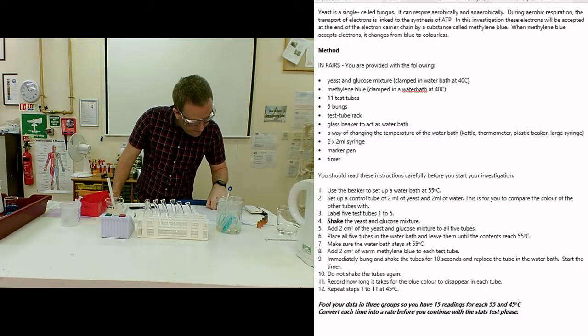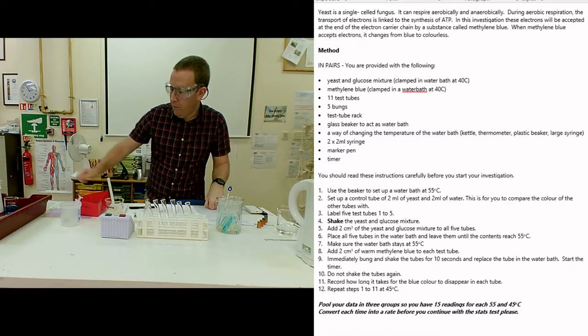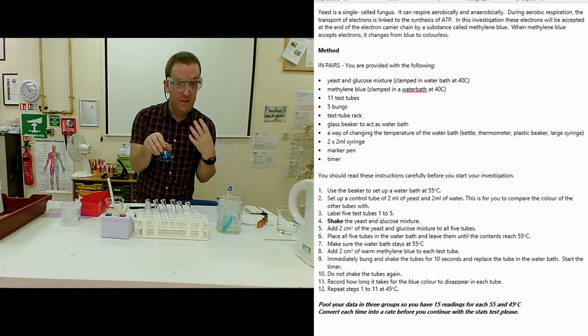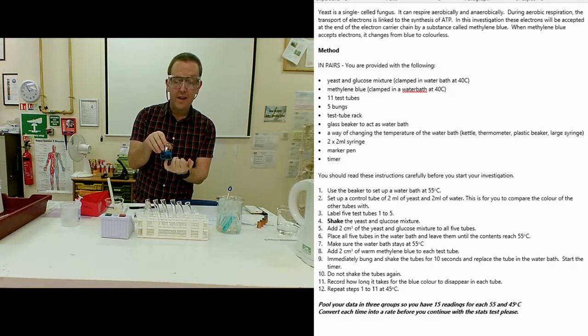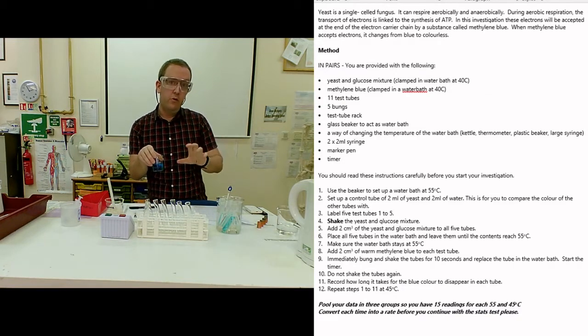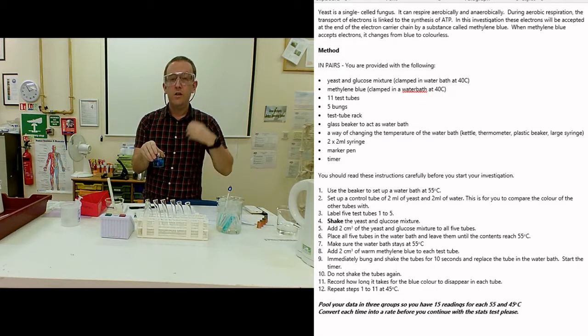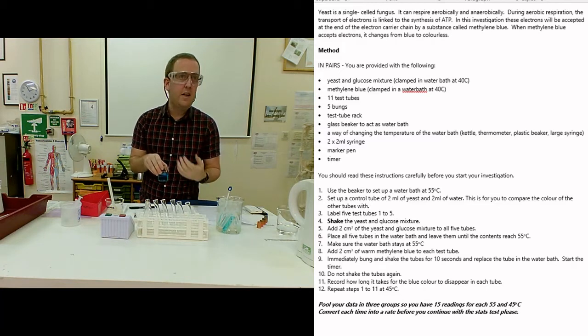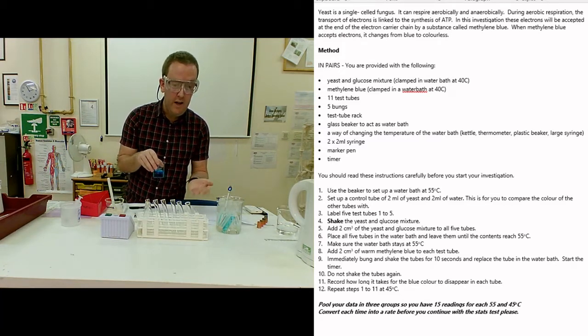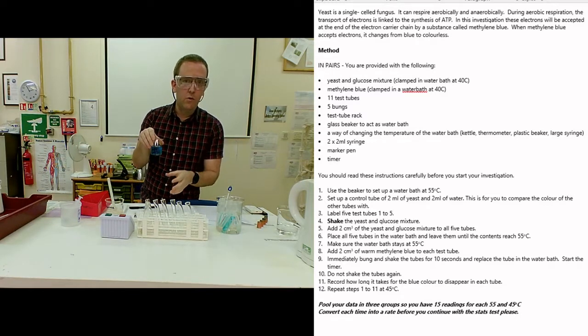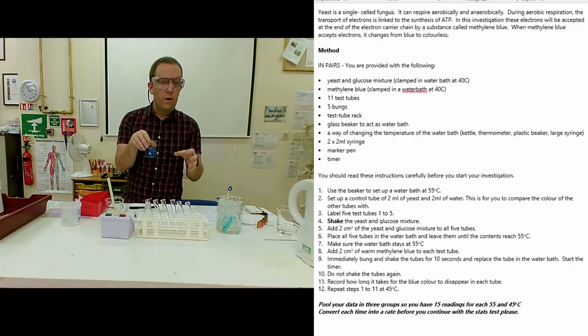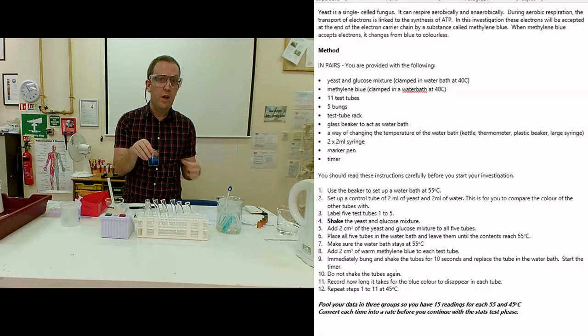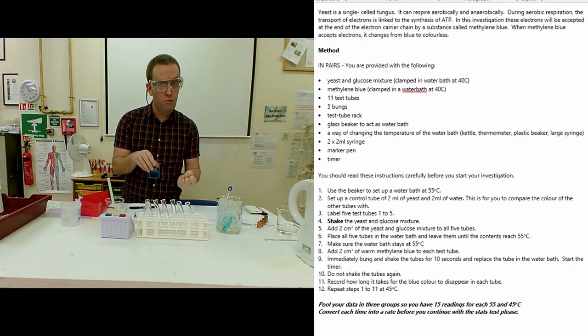Next, we need to pre-warm the methylene blue. This looks a lot weaker than the stuff you would have used as a stain for microscope work, and that's because it is. Obviously, one of the variables here is the concentration of the stain - too high concentration and you won't produce enough electrons to get it to decolorize in anything like a reasonable amount of time. This has been diluted. If any technical or teaching staff are watching, we've found that half the recommended concentration, even on the method sheets for this practical, is what gets you the best, most reasonable, most measurable results.